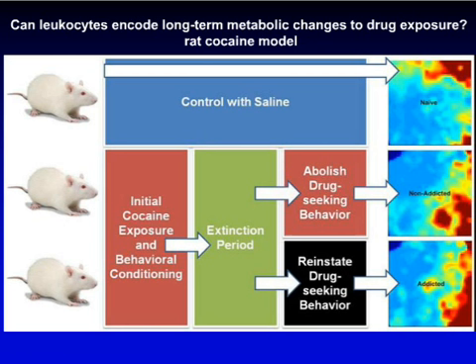Looking at the leukocyte molecular expression, each one of these self-organizing maps on the right encodes probably about 50,000 molecules. So you can see that when you have naive or non-addicted and addicted, those molecular signatures clump into different regions of space, which allows you to do prioritization to figure out which ones you want to identify.